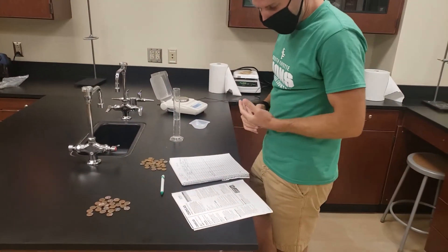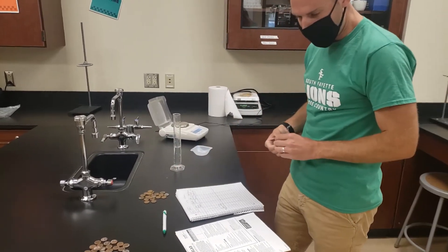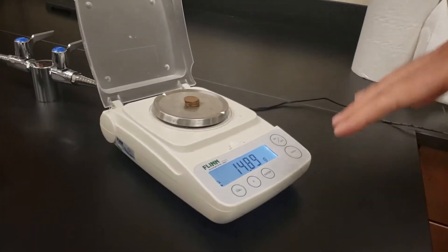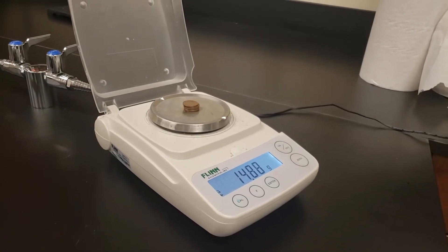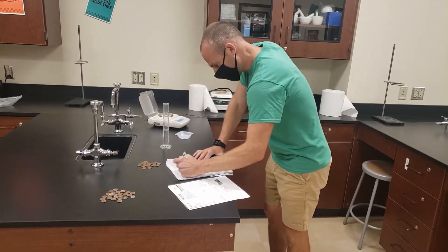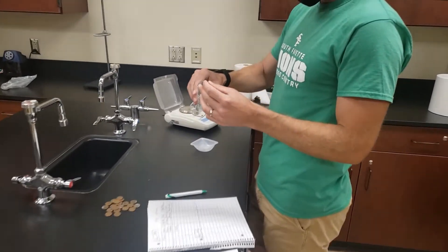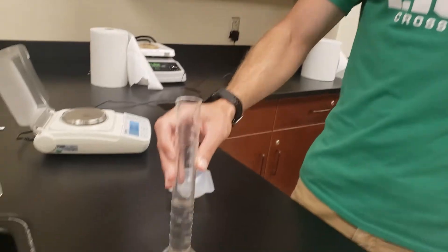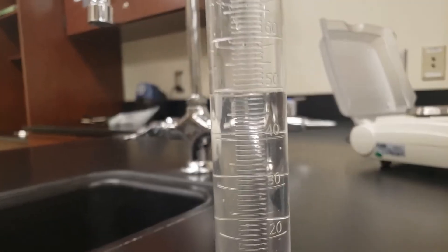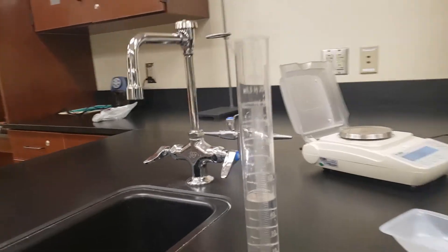It says to add 5 pre-1982 pennies to my graduated cylinder — but actually, it takes their mass first. So I'm going to put those 5 pennies on my digital balance, making sure it was reading triple zeros before I placed anything on it. Once that mass has leveled, I'm going to record the mass of those pennies. Then I'll add the 5 pennies to the graduated cylinder, tilting it so as not to splash any water out. I'll tap to remove any bubbles so they don't affect the volume reading, then record the new volume to determine the total volume of water displaced.